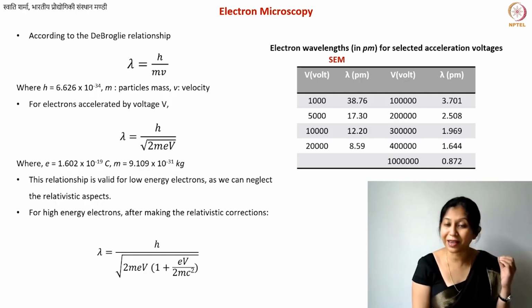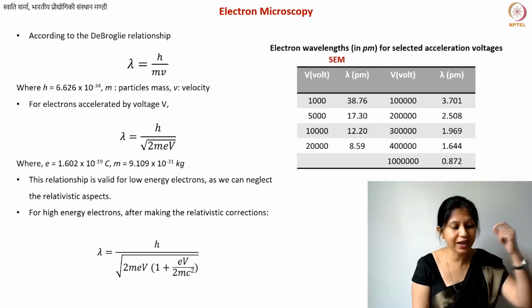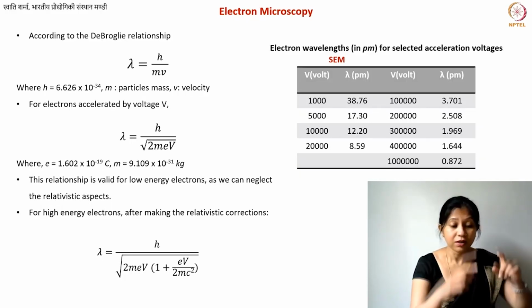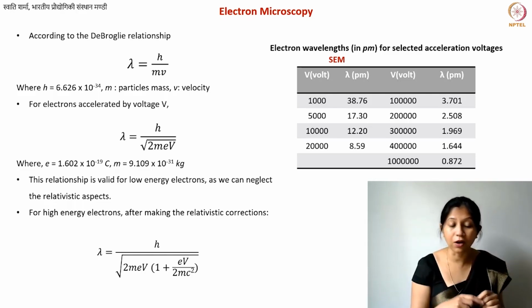What if your wavelength is even smaller? Then you can very clearly see your interatomic distances. You can even potentially see single atoms, although this is not often the case because of the instrumentation parameters. But in principle, you should be able to see single atoms using transmission electron microscopy. And there have been reports where people have observed the hexagonal rings of graphene, although, again, as I will explain to you, the interpretation can be tricky.